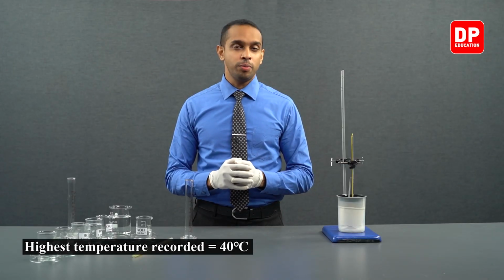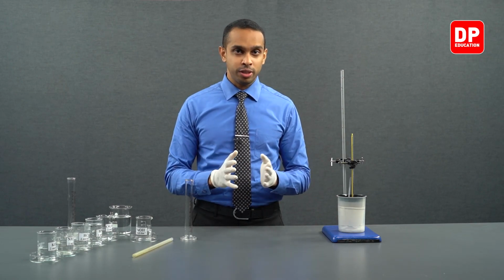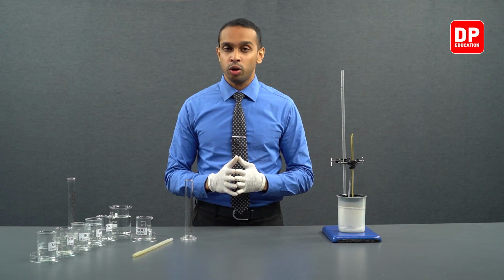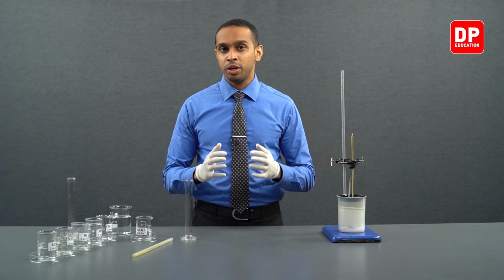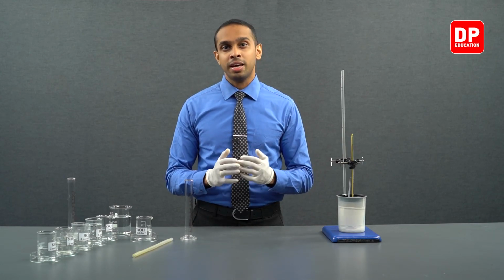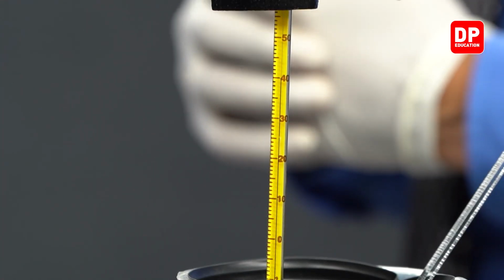Now, we observed when we initially mixed the hydrochloric acid with the sodium hydroxide solution, there was an increase in temperature all the way up to 40 degrees Celsius. And we observed if the temperature was increasing further than 40 degrees Celsius. However, now it has started to come down.